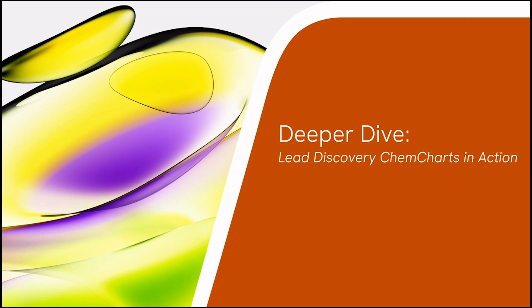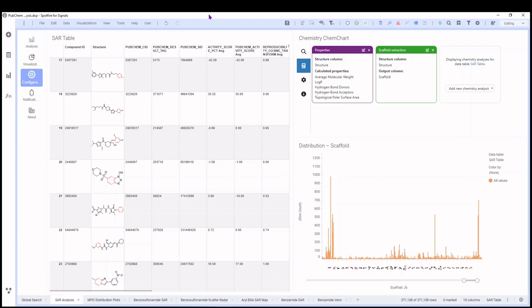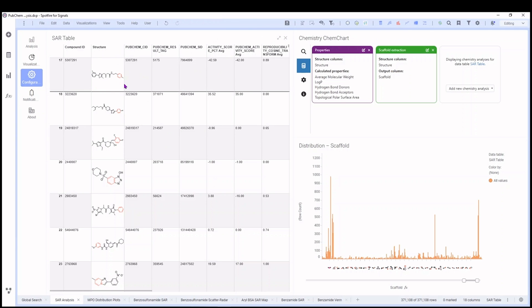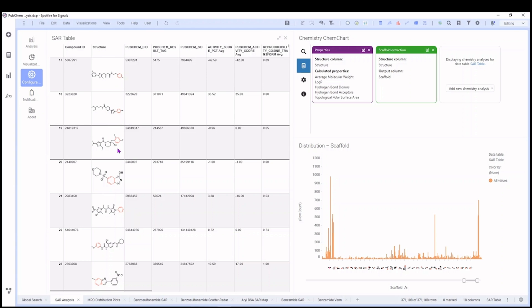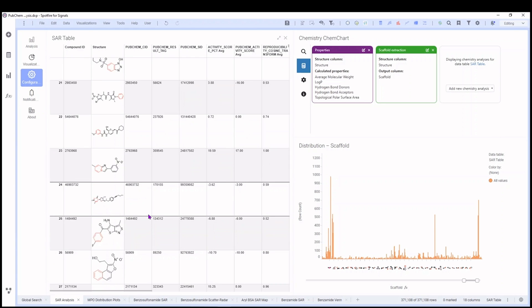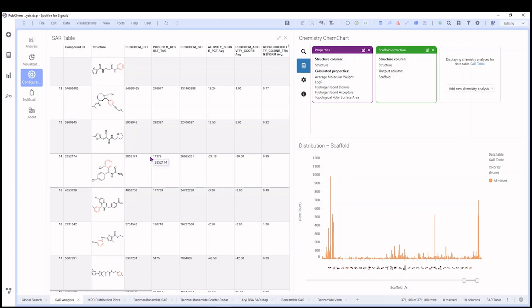So with that said, let's get out of PowerPoint and actually look at Signals Research Suite live so we can see how these tools all work with each other to help us find the value in our data. Now we've switched over to Spotfire for Signals within Signals Research Suite. You can see that I brought in that PubChem dataset and it came in as a table, automatically converting the SMILES string to a view of each chemical structure in the series.